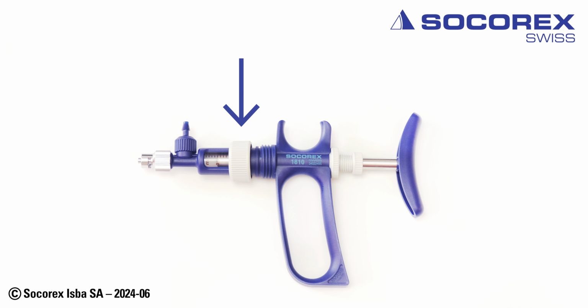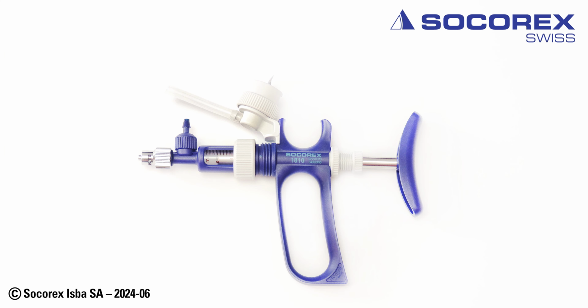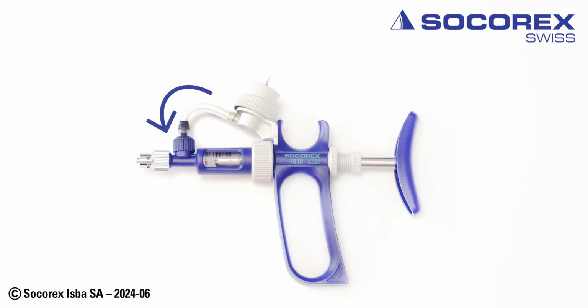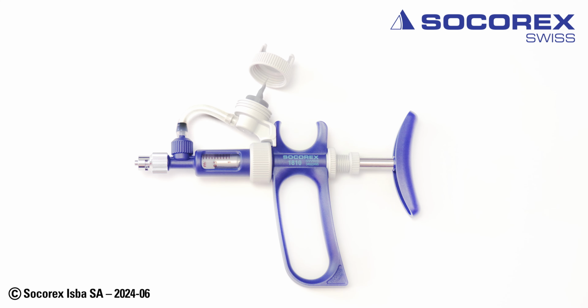Unscrew the casing nut and insert the vial holder into the groove. Screw the casing nut back on to lock the vial holder body. Connect the tube to the intake valve and remove the bottle lock.